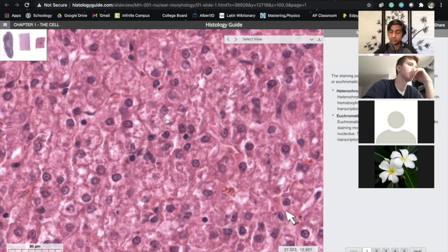And that's why we can't cut it. We try our best to cut it as specifically like a 1 cell thickness, but obviously that's impossible to achieve with the technology. And so that's why you'll see some overlap. That's why it's not exactly cell, cell, cell, cell, cell, as you might imagine. But in a plant cell, you might see that because you have the cell walls that rigidly fit together.